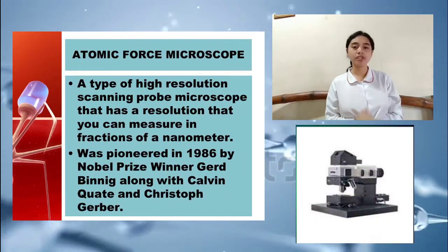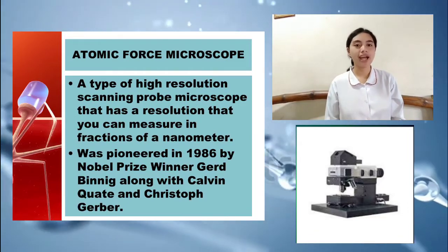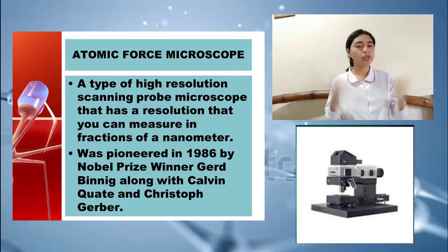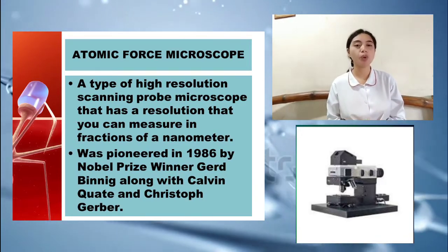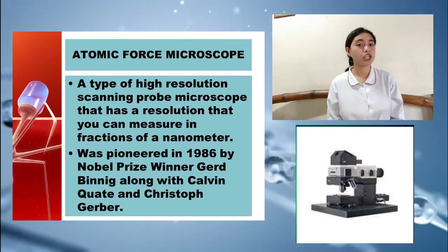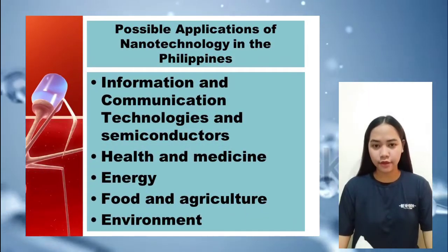The atomic force microscope was pioneered in 1986 by Nobel Prize winner Gerd Binnig, along with Calvin Quate and Christoph Gerber. But what is an atomic force microscope? It is a type of high-resolution scanning probe microscope that has a resolution that you can measure in fractions of a nanometer.